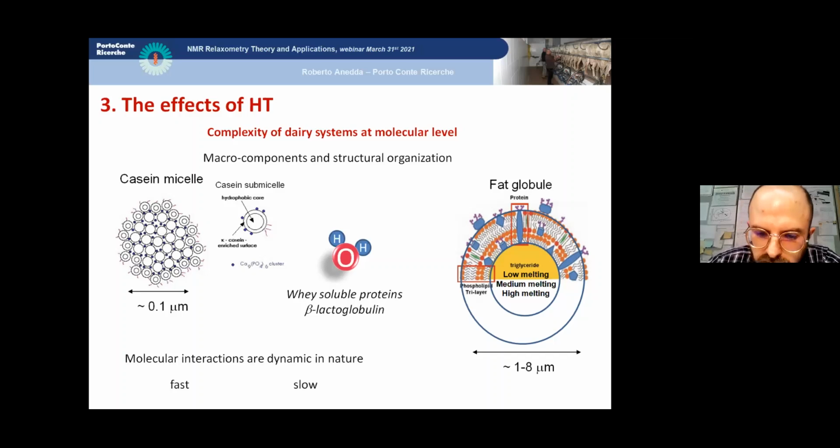For example, it was found by NMR works that with increasing temperature, the solubility of calcium and inorganic phosphate in solution is reduced, leading to precipitation of phosphate and calcium. And dissolution of micellar calcium and phosphate was found to be strictly related to the relaxation rate of protons, because it interacts with the casein hydration state.